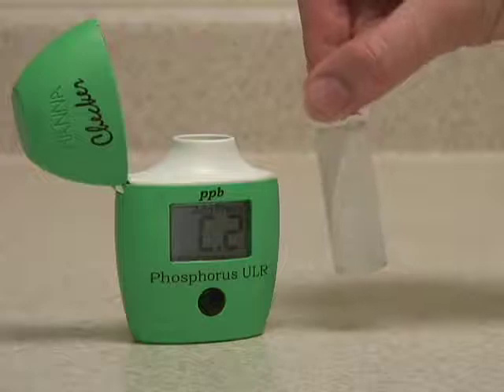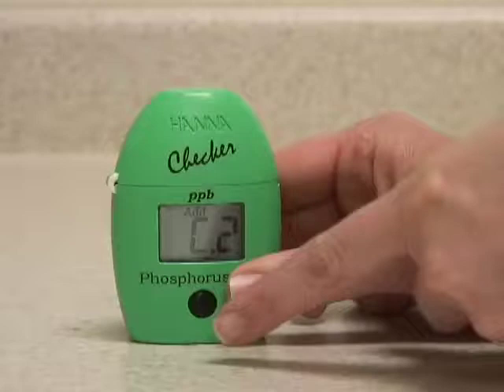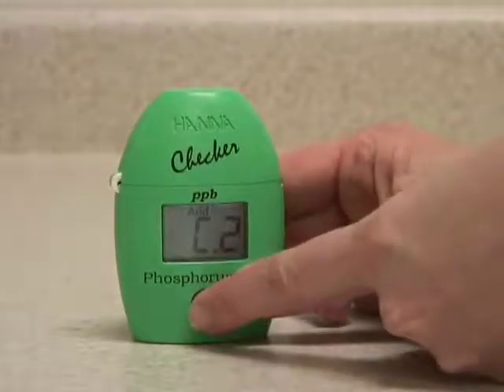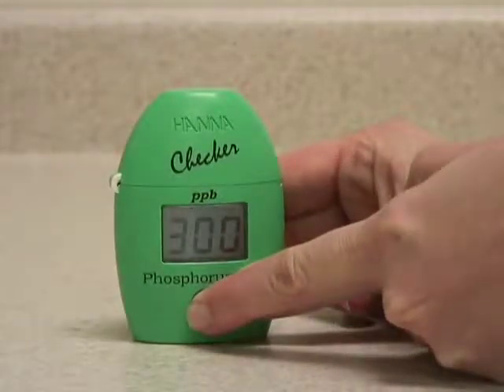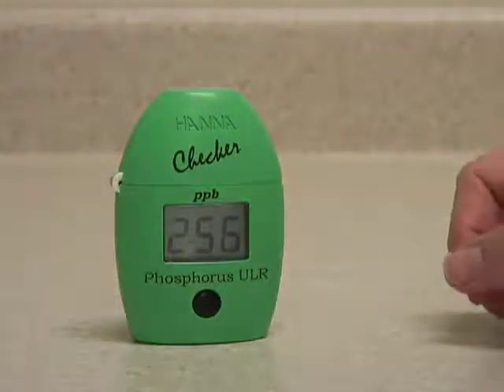Once the reagent is mostly dissolved, you can insert the vial back in the meter, close the cap, and press and hold the button to activate the read time function. The meter will count down three minutes, then analyze the sample and display the reading.